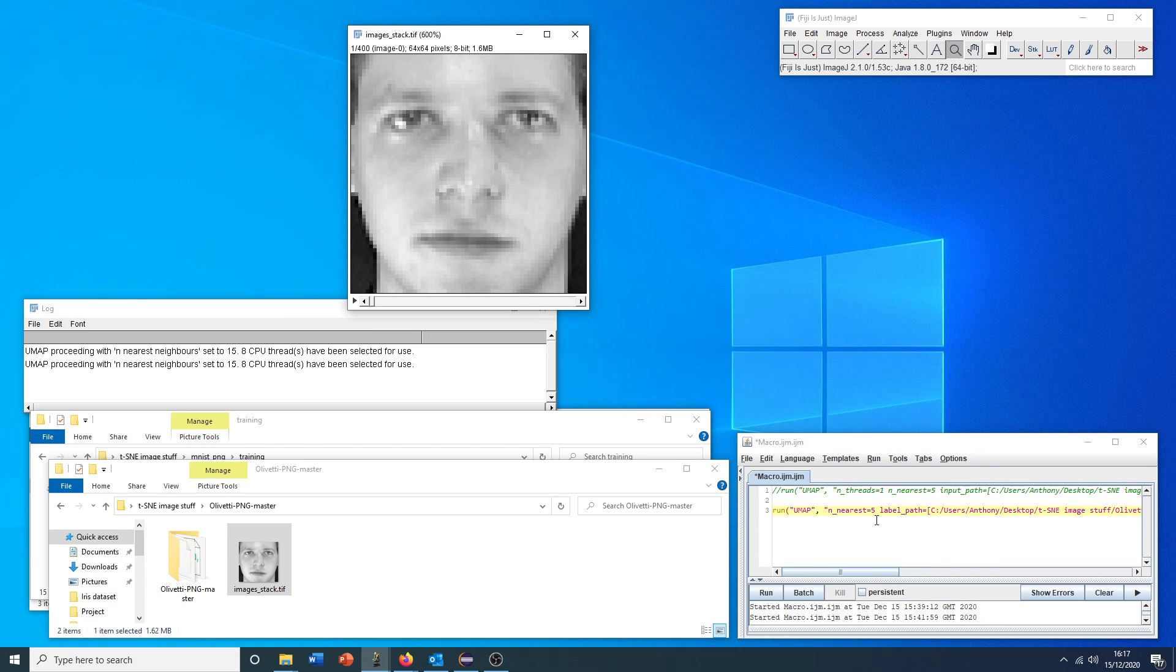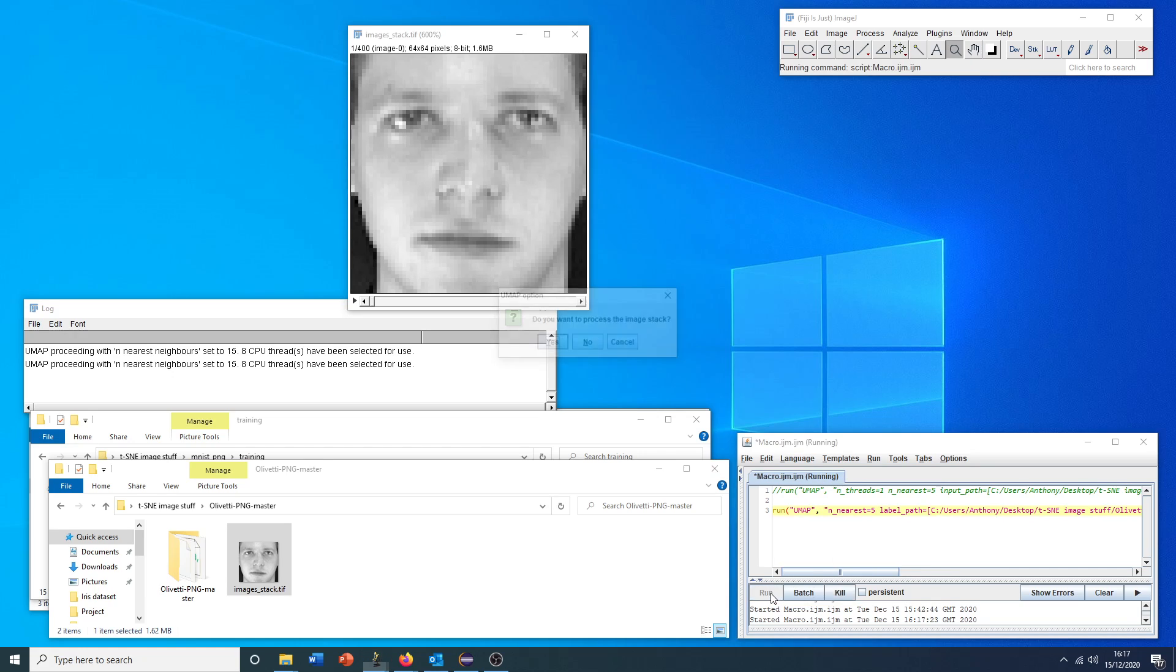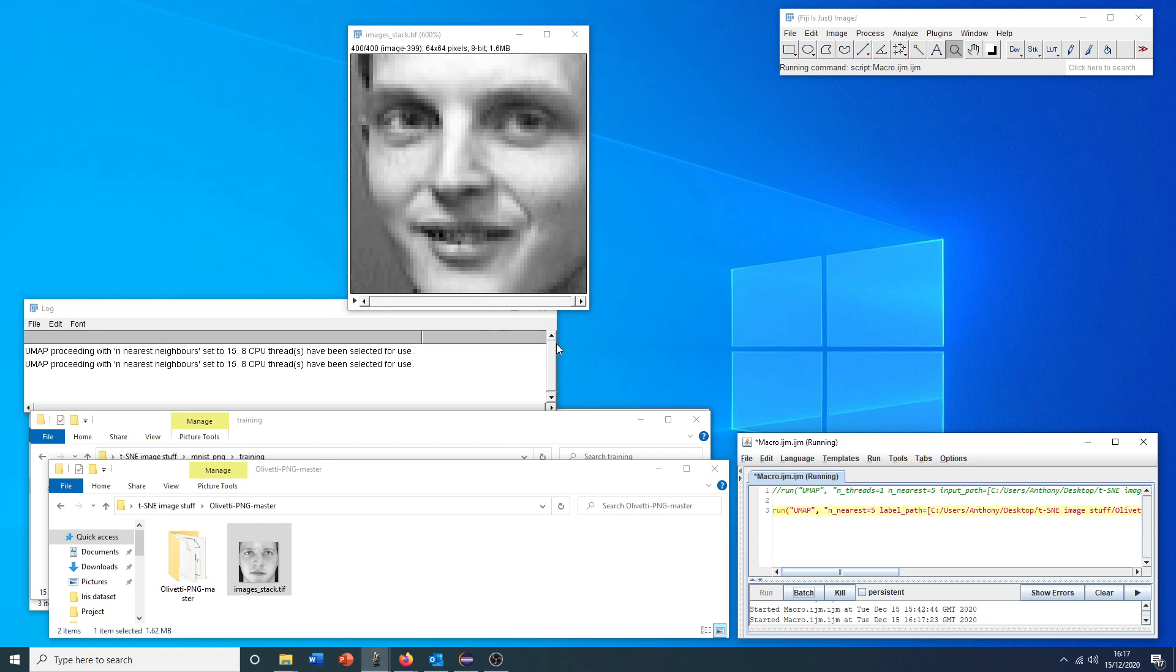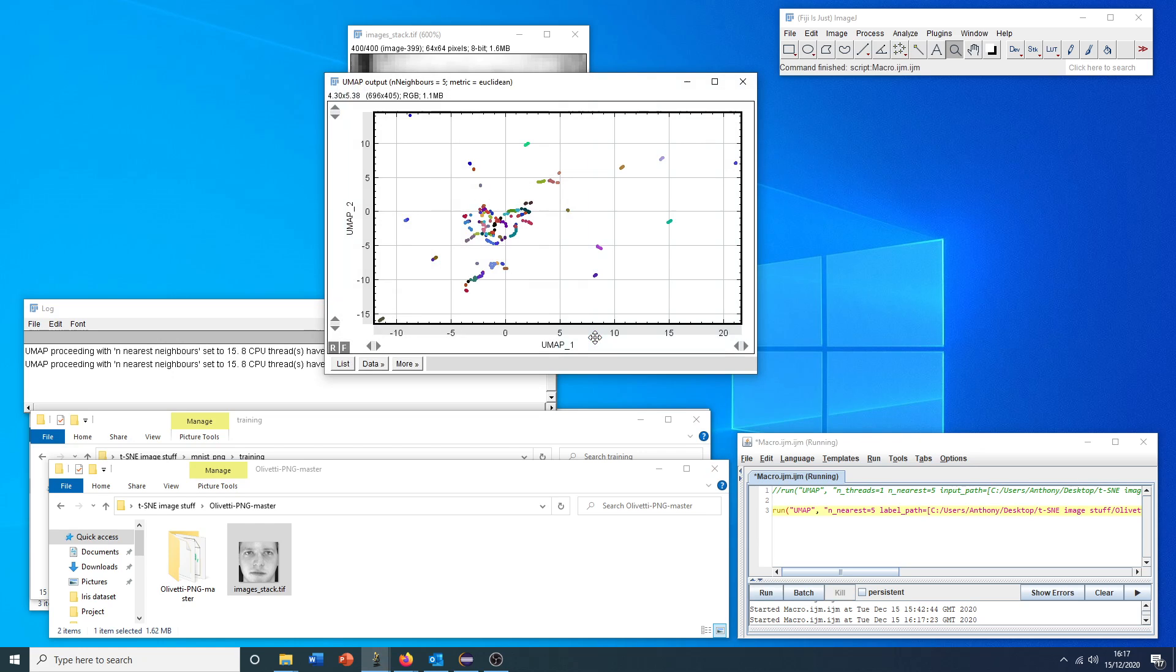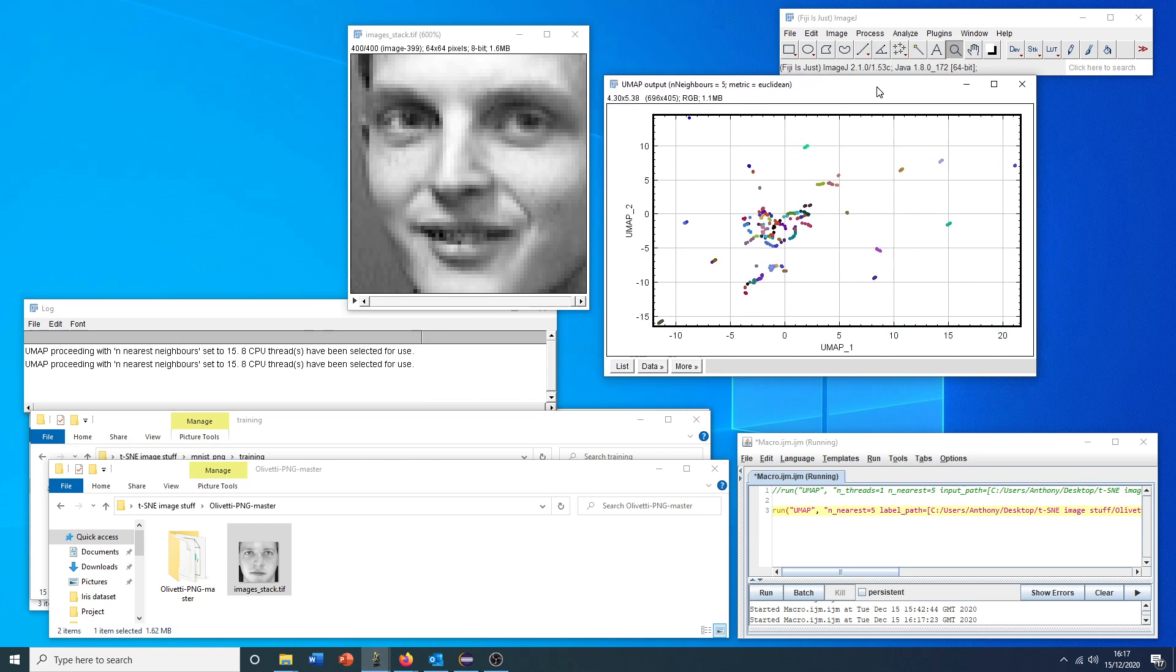With that on screen, we can click run. Hopefully this works. Yes, you want to run it on the image stack. And here we go. Voila.